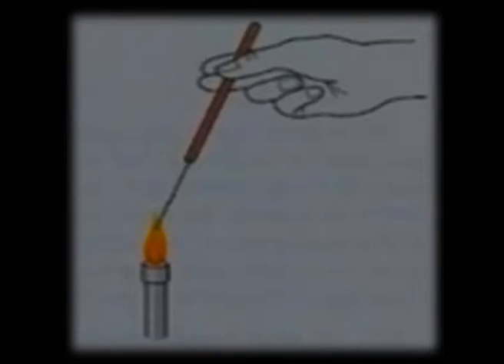You all know that in our microbiology labs, we directly flame the inoculation needle to remove all the microbes that are present on the needle. So it is very essential that needles are incinerated properly before inoculating any culture into sterile media.